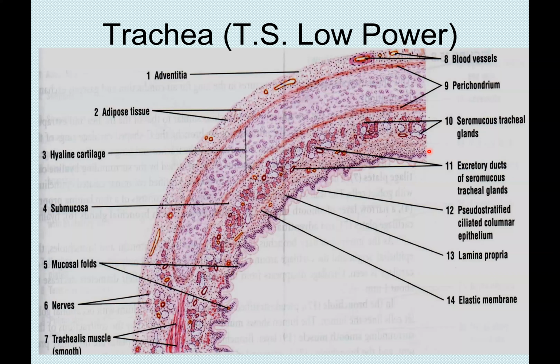Okay, and then following this, you can see this side, that there are some small blood vessels in there. So far as you begin to see a blood vessel, it tells you it is a connective tissue. So this is the lamina propria, which will follow the epithelium. That lamina propria is actually a connective tissue, and the type of connective tissue you see there is a loose areolar connective tissue.